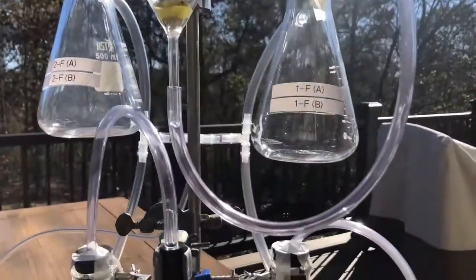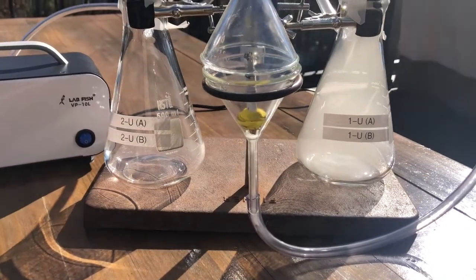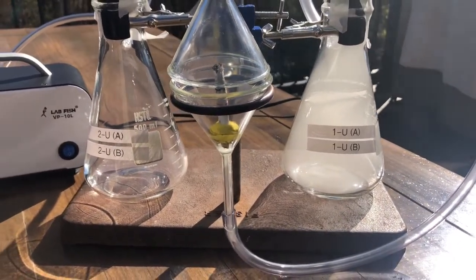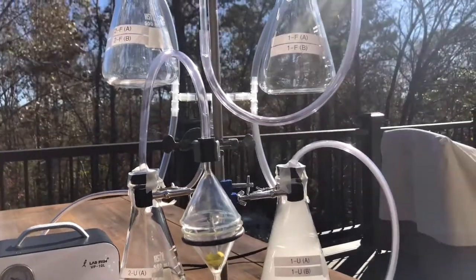While it's running, I just want to show you, there's the unfiltered. Even with our filter paper, there is the unfiltered cigarette there. And that is the first-hand smoke versus the second-hand smoke. That's pretty impressive.